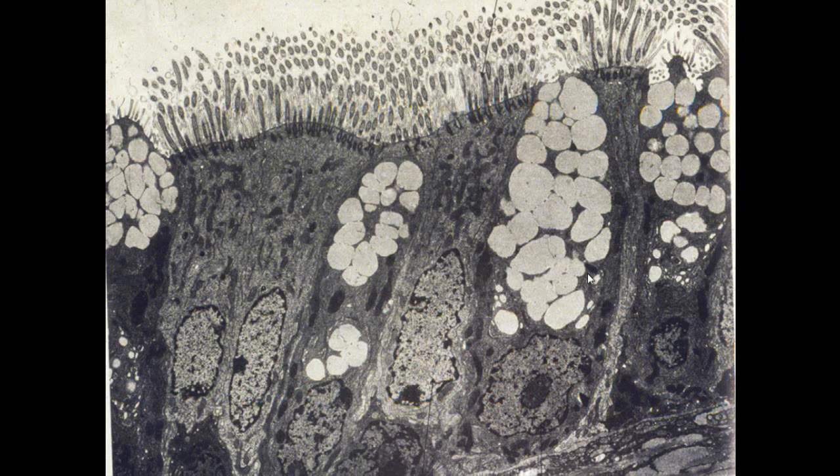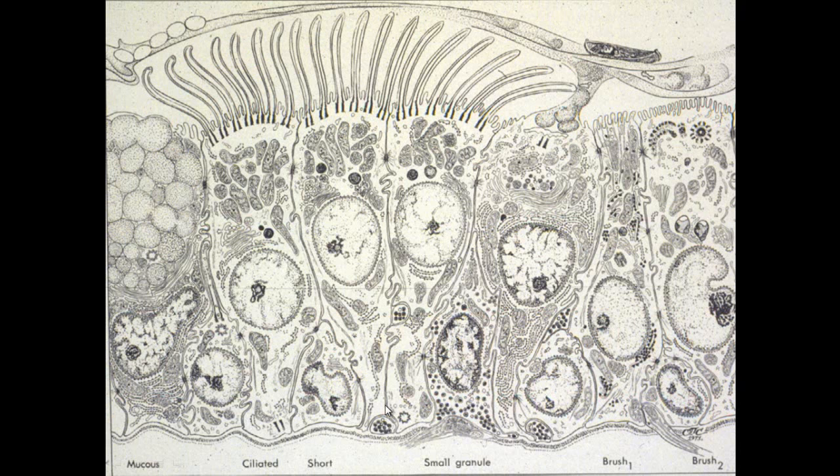So, another view of that: these are the goblet cells that secrete mucus, and you can see the mucus being projected from those. You have the ciliated cells. There are also basal cells in through there as well. What happens is the goblet cells secrete a mucus that lines the airspace, so the air is going through there. Dust particles get trapped in there, and then the ciliated cells, with their actions, move the dust along like a little boat, and it just washes it away.